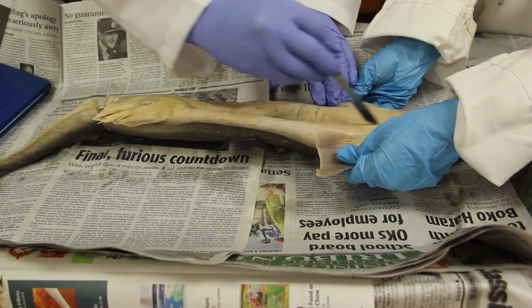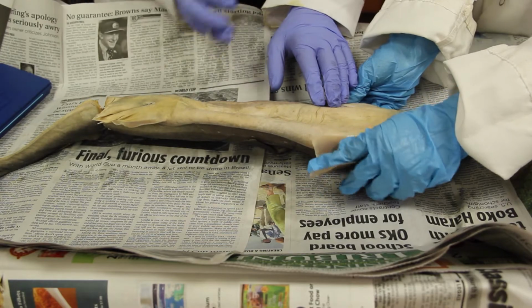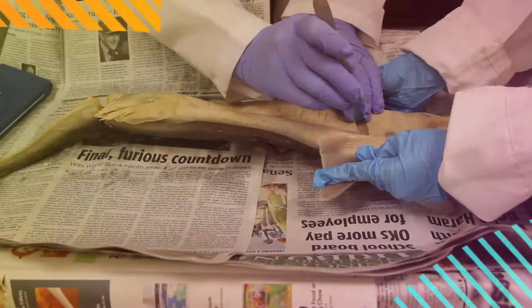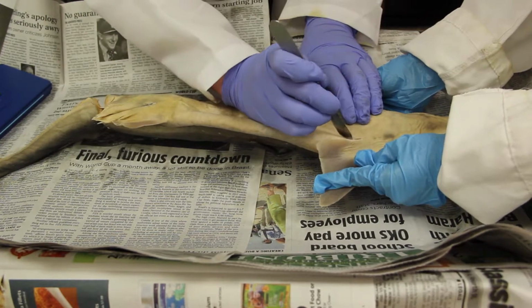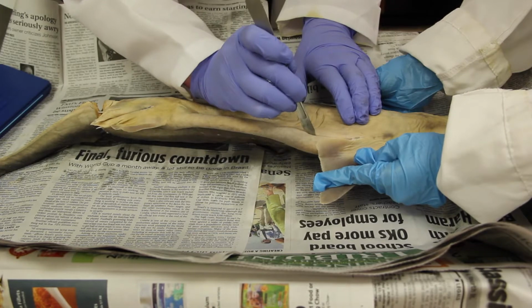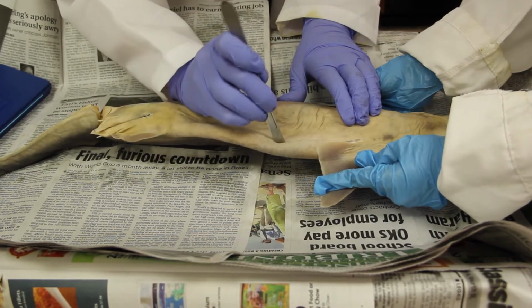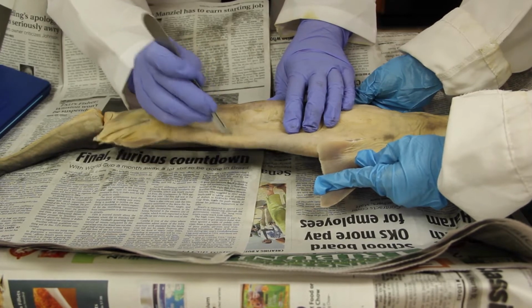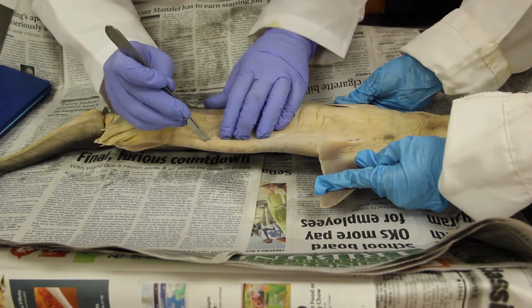So you just keep going all the way down, and then we'll make one here and here, and so here we go. Make sure you keep your cut shallow because you don't want to pierce any of the organs. His skin is pretty thick, but see, there we got a pretty good cut.